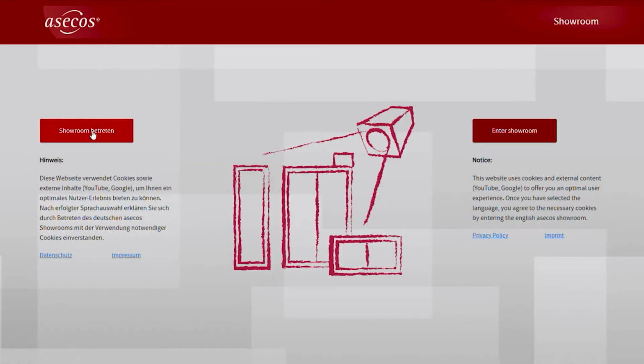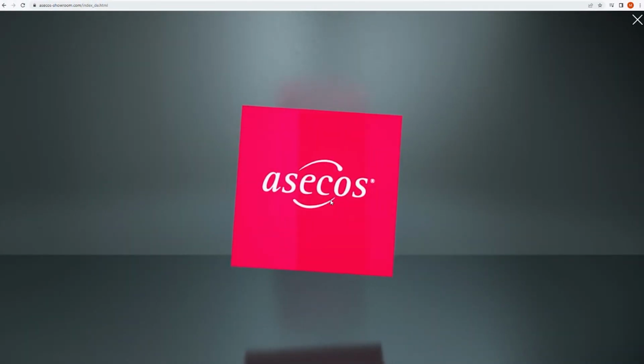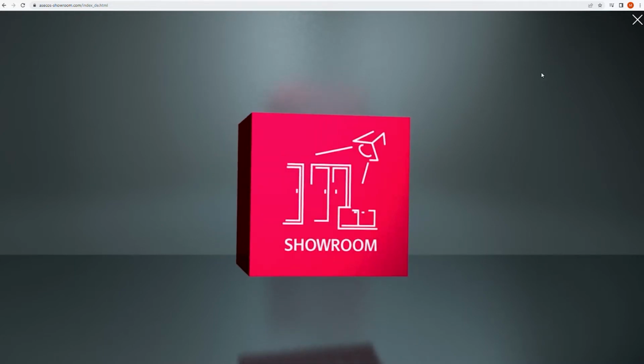To access the digital asecos showroom, enter www.asecos-showroom.com in your preferred browser, for example Chrome or Firefox, and this will take you to the upstream language selection. Here you have the option of displaying the content in German, left-hand side, or English, right-hand side. Select the desired language, click on the play button to start the intro of the digital showroom, which can be skipped right at the top.